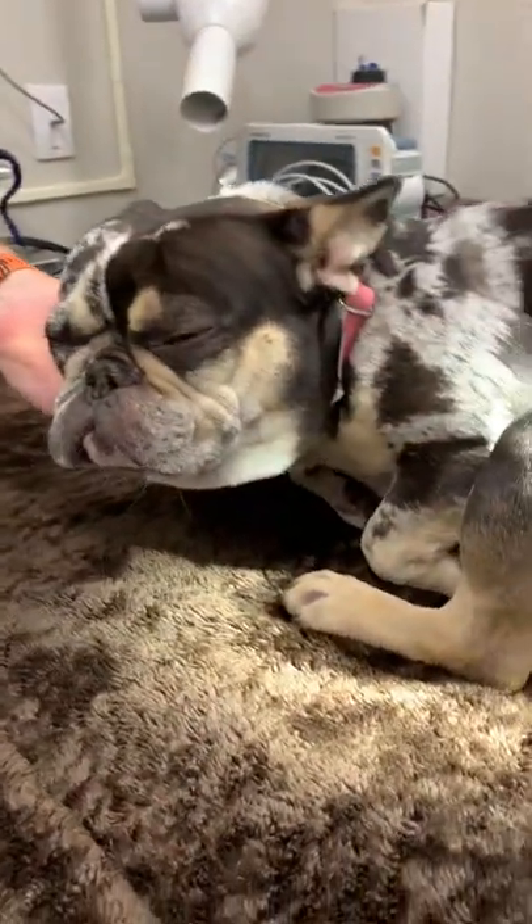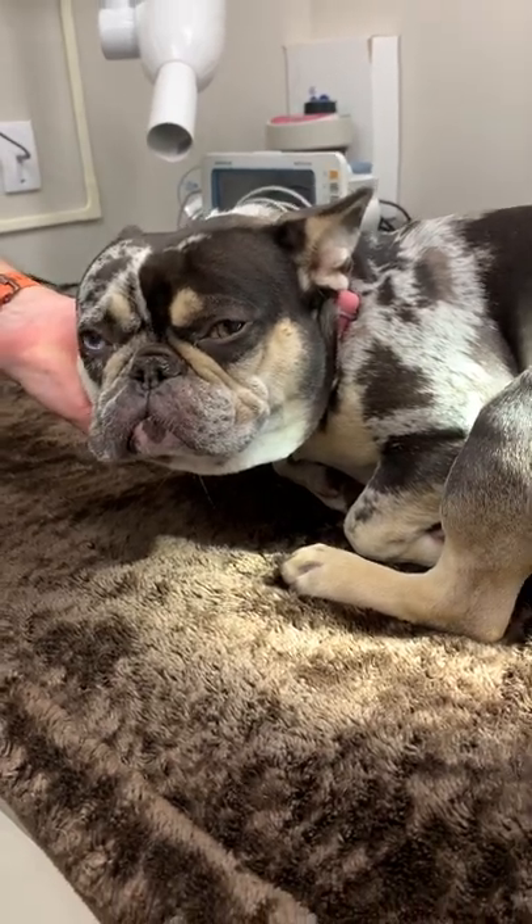Hi, my name is Sam Kippen. My student number is T00698764. This is Ro. She's an unspayed female, about a year and a half. We're going to be doing the vaginal cytology with Ro here today.